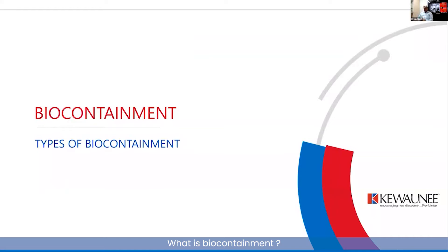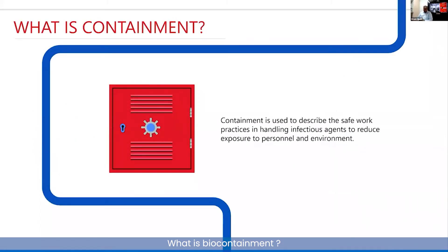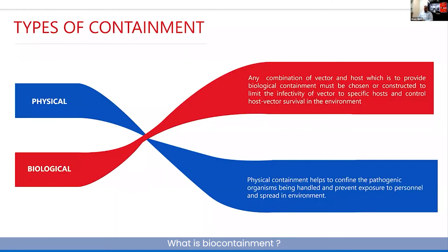Now let's move on to understand containment. We have already covered what biosafety levels are and what a biohazard is. Containment is any means or science we apply to make sure we are able to confine a microorganism from exposure to people and to the environment, thereby preventing the risk of disease. There are two primary containment methodologies: biological containment and physical containment.